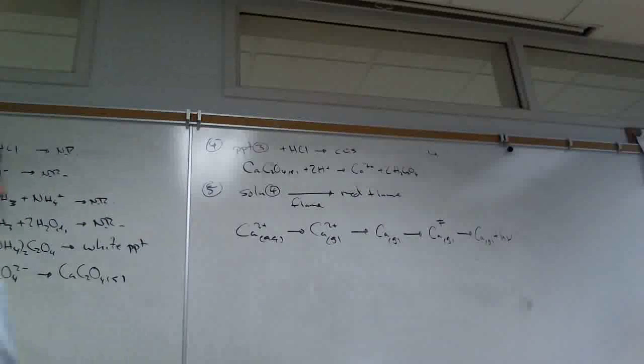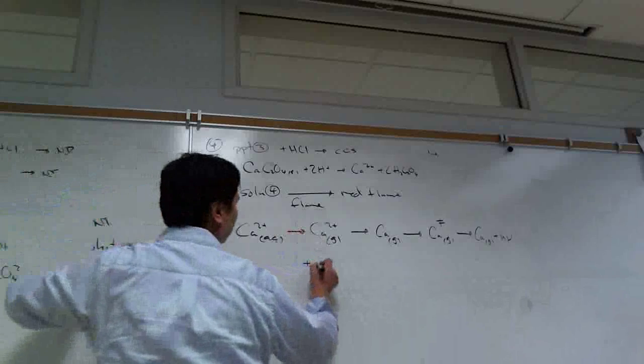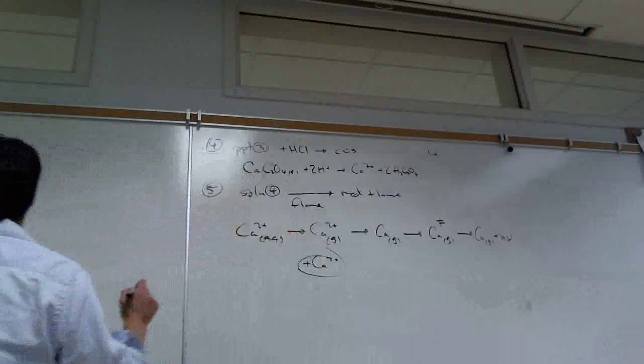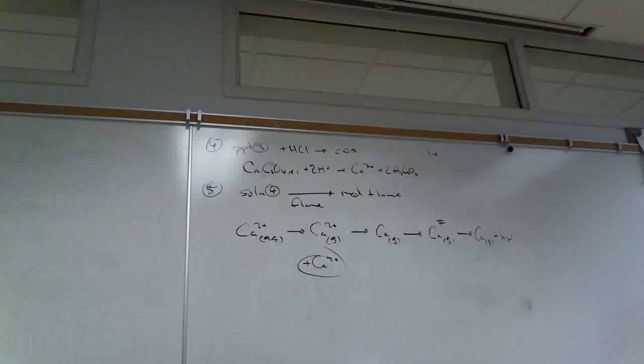All right. So you should get the brick red. This would be positive for calcium ions here, and then 2 more ions. So we have the sodium ion test, where we take an unknown and just put it straight into the flame. Sodium is incredibly sensitive, so you should get a very intense yellow flame. If you get a very dim yellow flame, you might think maybe it's contaminated.